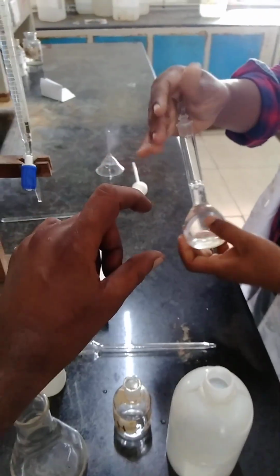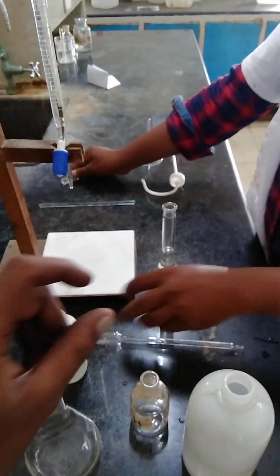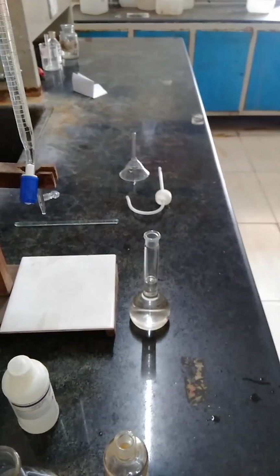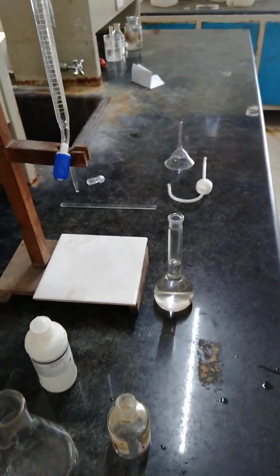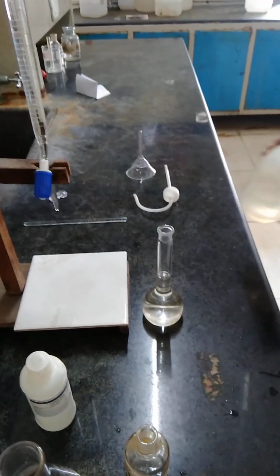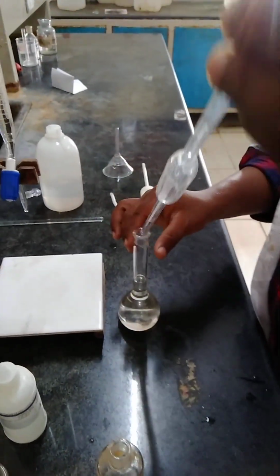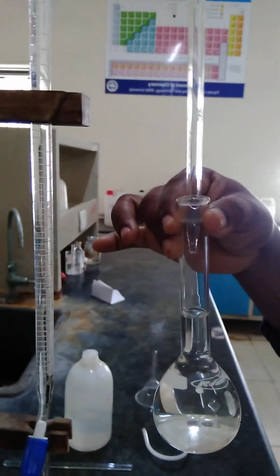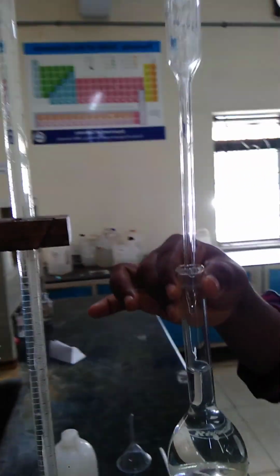First add a little quantity, then shake very well. Then again add a few more. Then take the pipette for the final makeup. Since the solution is colorless, read the lower meniscus.